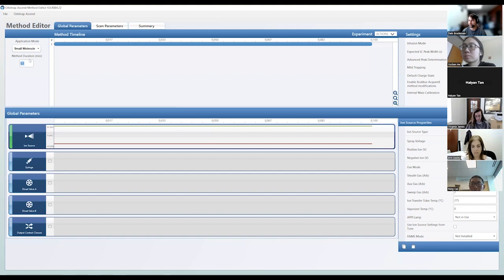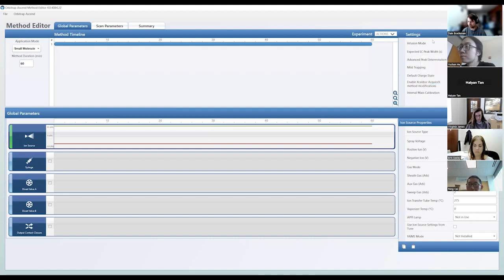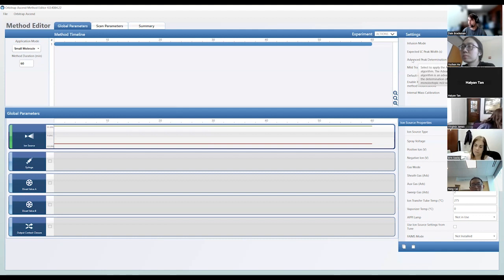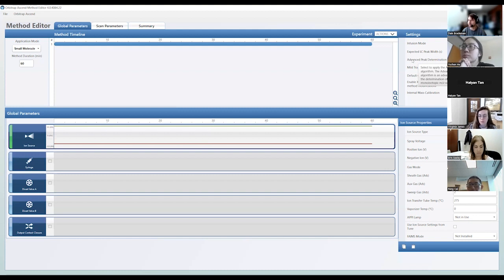You also want to change your method duration to how long you actually want your LC analysis to go — we typically do 60 minutes for our real-time library search work. For expected LC peak widths in the right-hand settings, I usually set it to about 10 seconds. We always want to use advanced peak determination, which allows the instrument to better deconvolute co-isolated species at the MS1 level so you can properly assign monoisotopes, isolate correct precursors, and get more accurate results during data processing, since search algorithms use the monoisotopic precursor m/z for MS2s.